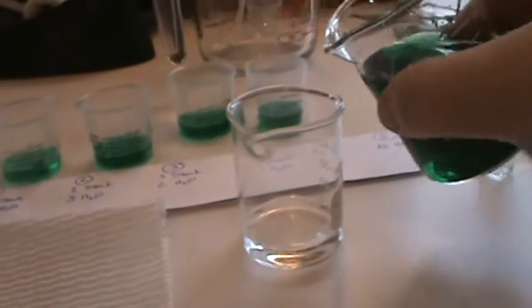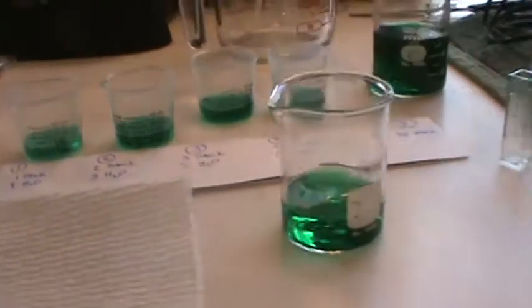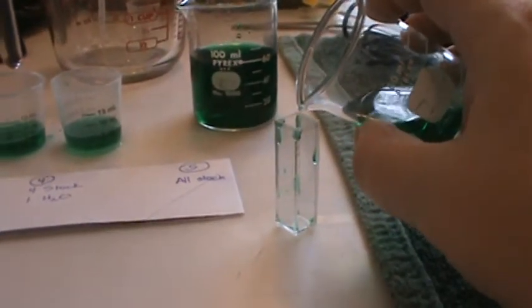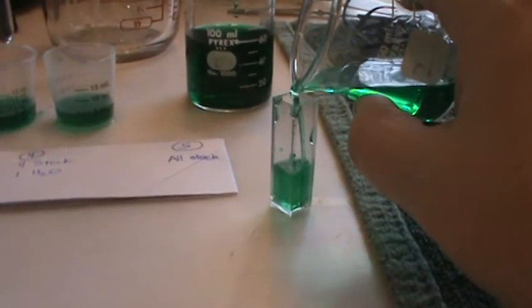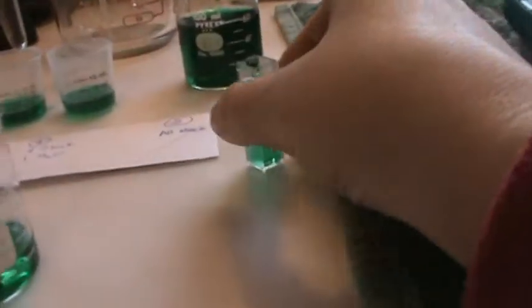All right. Well, you know what I'm going to do? I'm going to make an unknown right here. Let's see what happens if, and I'm going to turn this so that I can't see any values, and I'm just going to pour in some water, and I'm going to pour in some stock. Now, I can swirl it around and I can say, oh, I wonder what I made. Well, I can use this method and the value that you guys are going to get to determine what the concentration is of the solution that I just mixed.